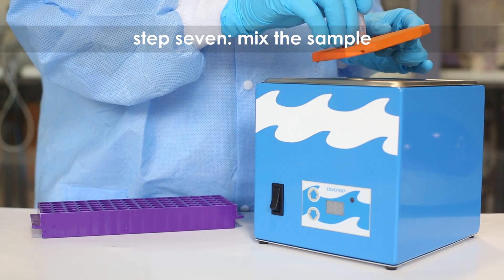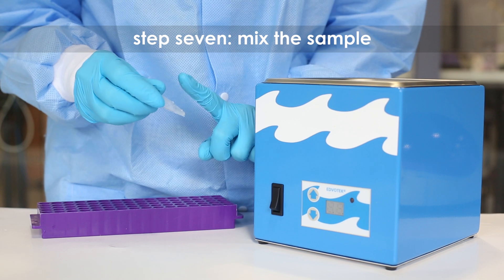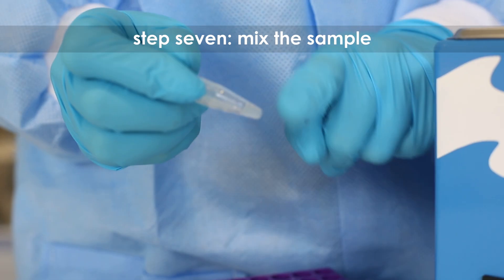Step 7: Mix the sample by vortexing or flicking the tube vigorously for 20 seconds.